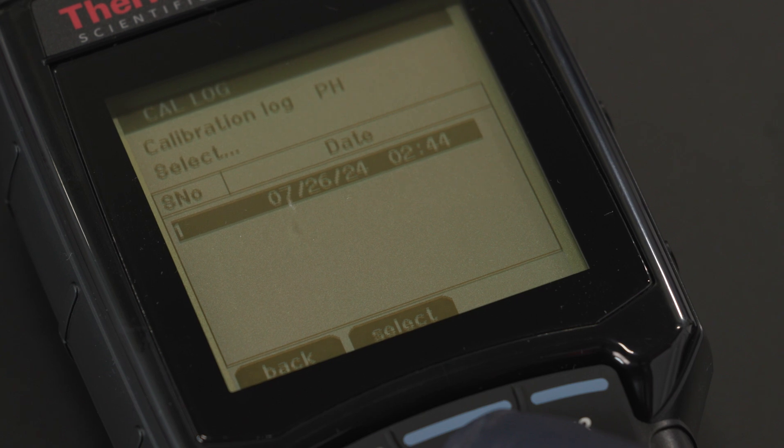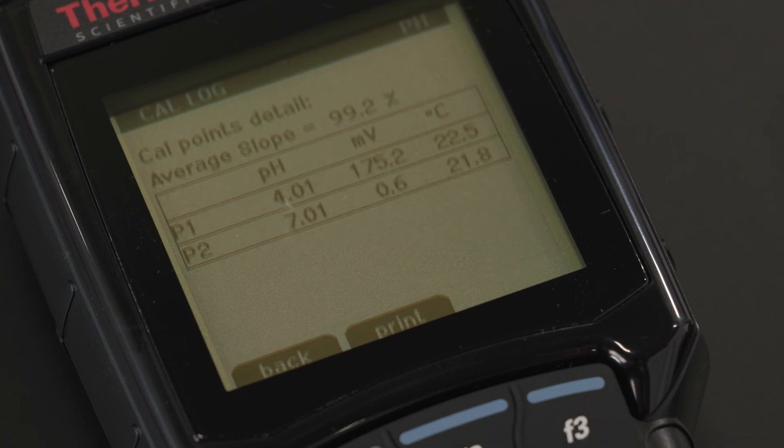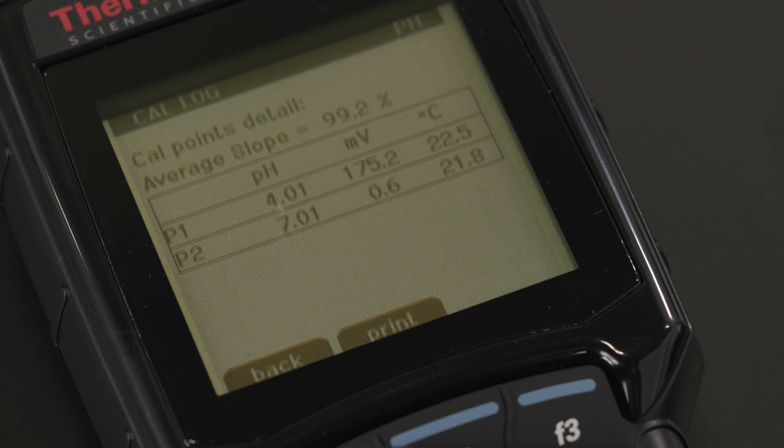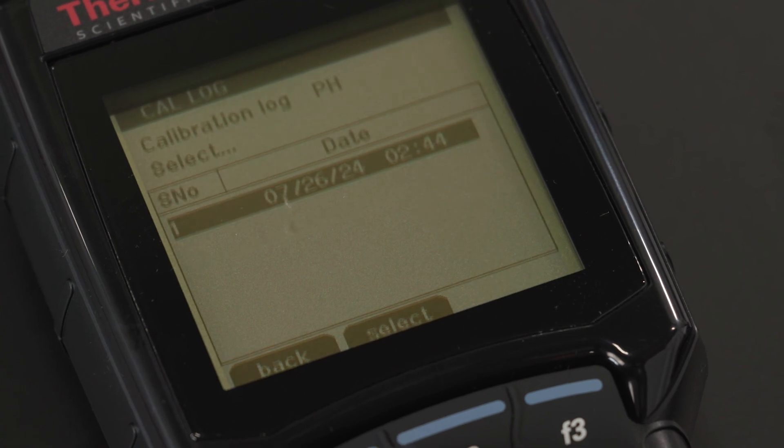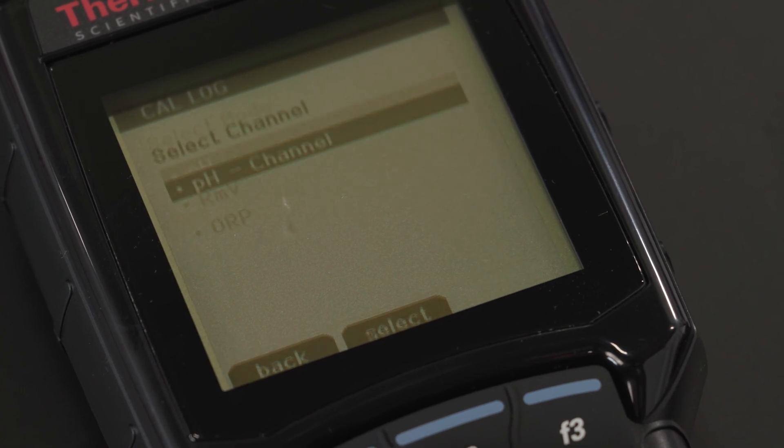Next, consider your needs for data capture and transfer. A larger capacity of both the data and calibration logs will support extended monitoring, trend analysis, troubleshooting, compliance, and historical reference.